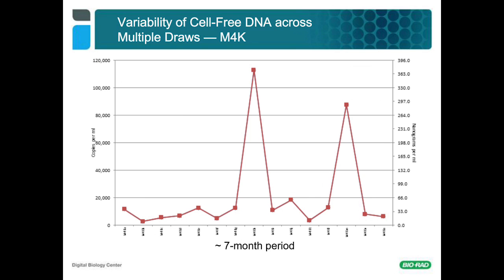This patient had 15 draws over a 7-month period. As you can see, the amount of DNA per draw was highly variable. Unfortunately, we don't have any data to correlate these time points based on treatment or response.